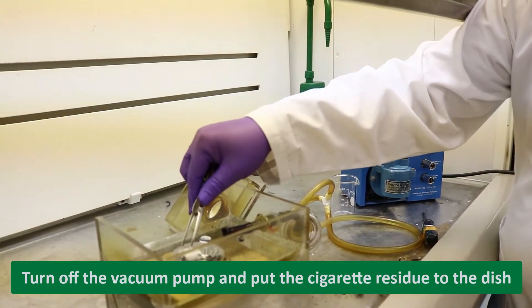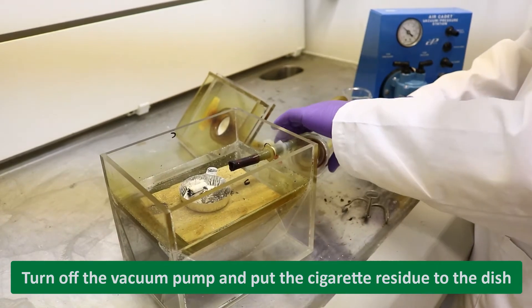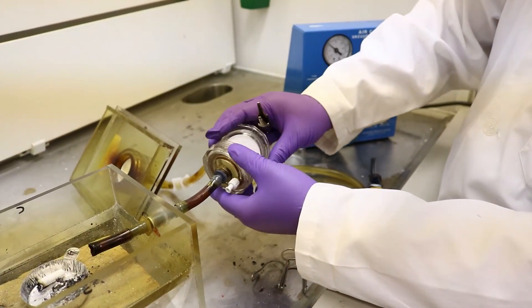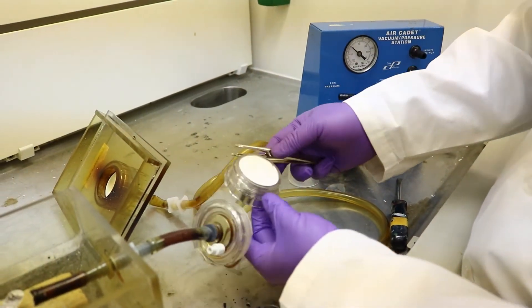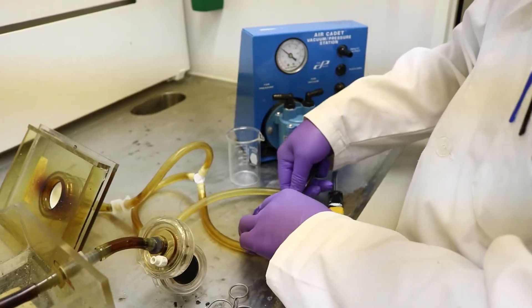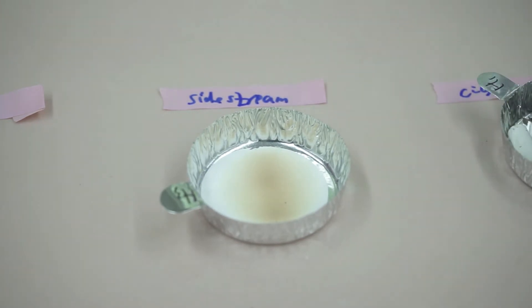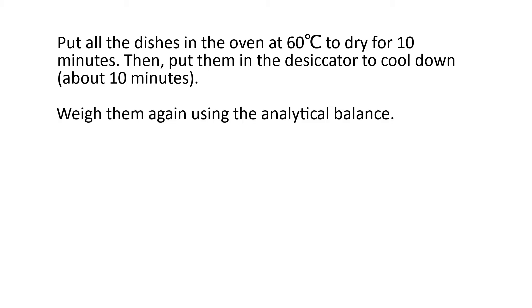Now take the cigarette residue from the tubing and put it in the collecting dish — this is the dish with ash that fell while the cigarette burned. Open the inhale line filter holder and transfer the paper into the original inhaled dish. Open the side stream line filter holder and transfer the paper into the side stream dish. Put all the dishes in the oven at 60 degrees Celsius to dry for 10 minutes, then take them out and put them in the desiccator to cool down. Weigh them again using the analytical balance — make sure to use the same balance.